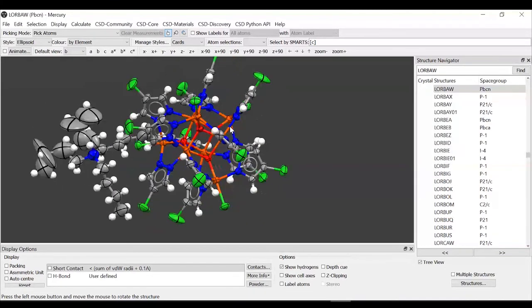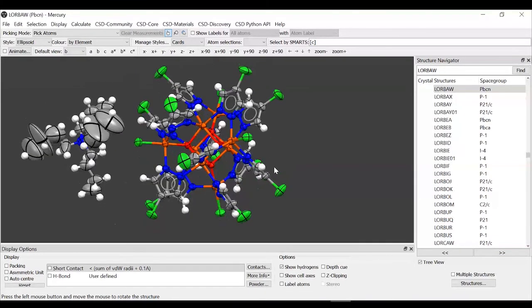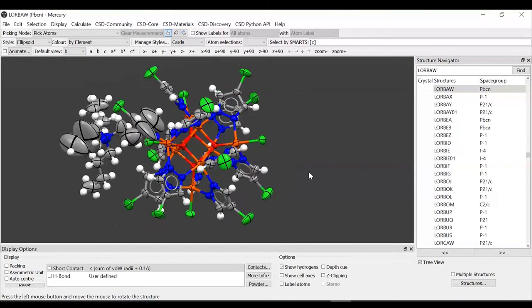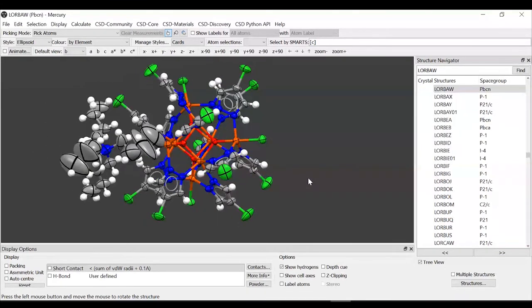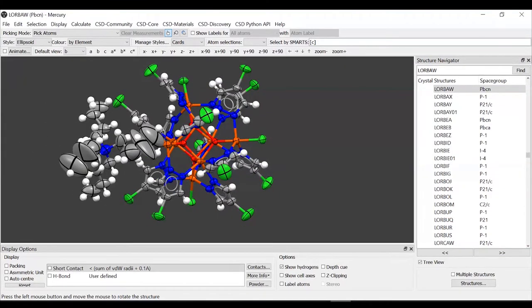This is the representation that we used to prepare the image before.